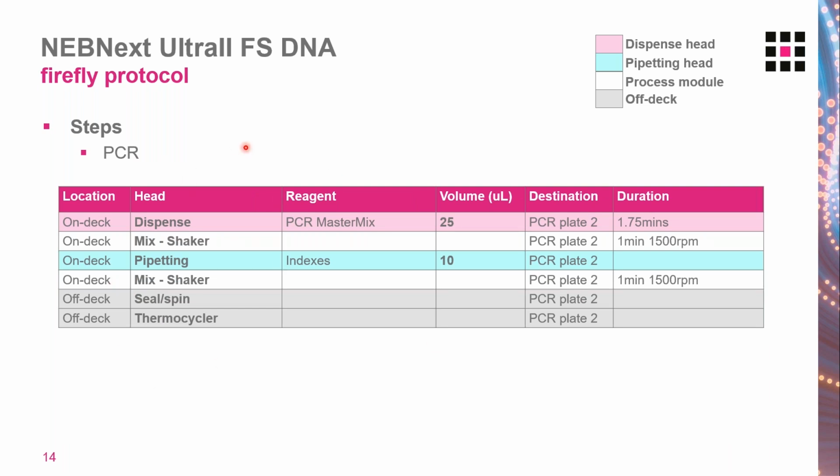This is the third sub-protocol we prepared. This is the PCR prep. We've got the dispense of PCR master mix, a mix on a shaker, and then we're using the pipetting head to transfer in our indexes, and then another mix before sending the plate off to the thermocycler.